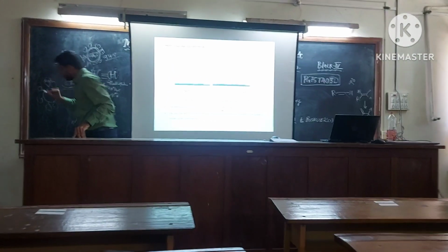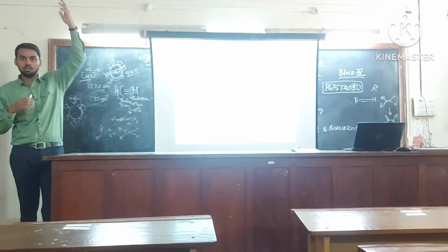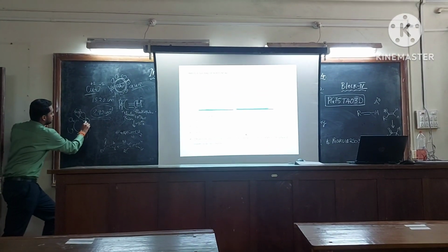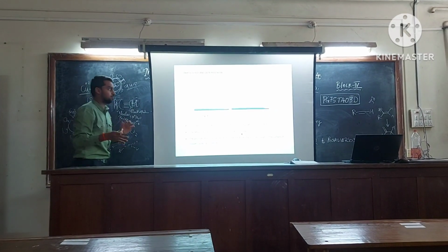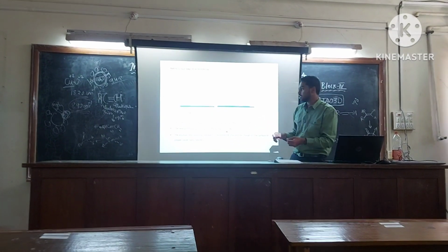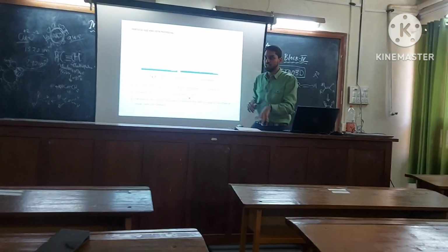And there is a difference. If I say the word potential, potential means something which is related to difference. If I take an overhead tank in front of our house, that storage tank, and a lower tank, the water will flow because of potential difference. In a similar fashion, there is a positive and there is a negative sign. So the difference is zeta potential. That potential came to be about 67.7 millivolt. So since we are getting it on the positive side, we can say that the copper oxide nanoparticle is surrounded by, made up of, the positive sign.